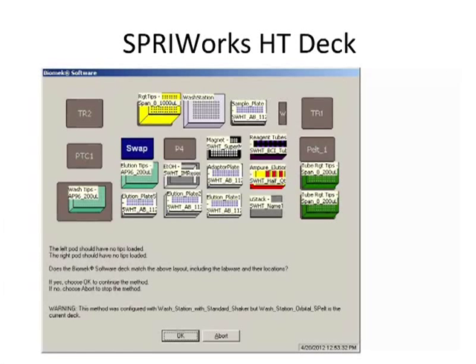The only additional accessory here is an orbital shaker, which is at this position here. So the SPRIworks HT deck is actually a very elegant solution. By using it and having an opportunity to test it, we learned quite a bit and were able to make improvements to our own methods.